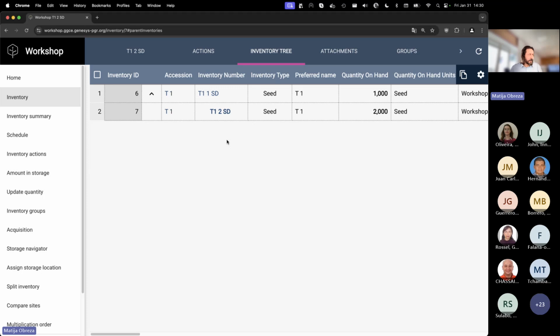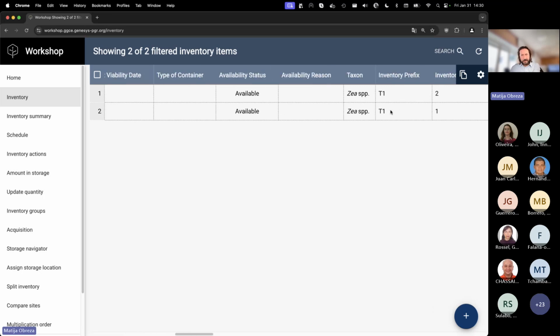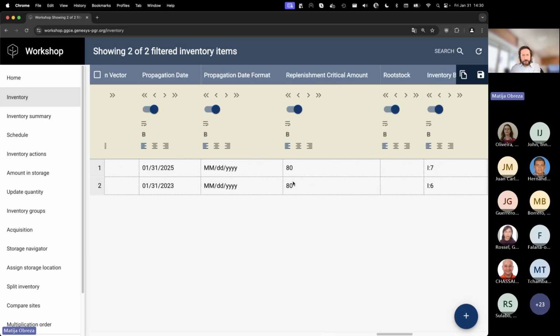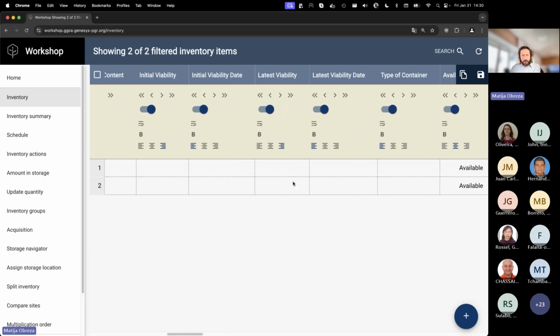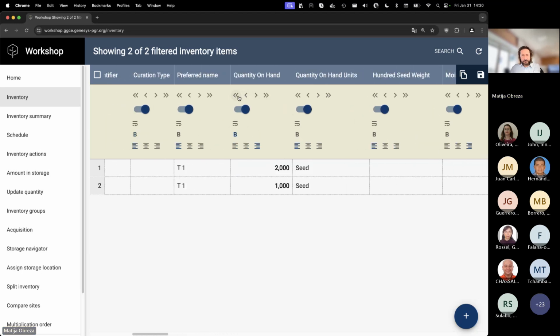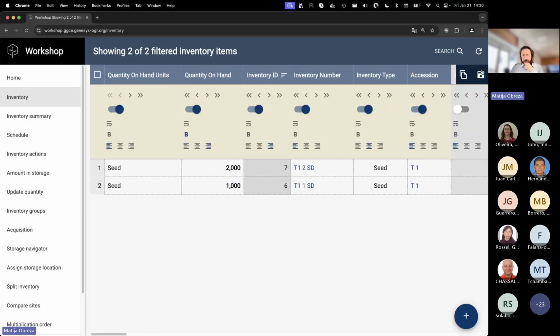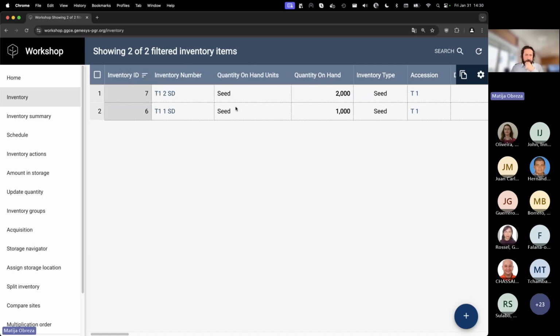With that, the important part: what is not an inventory? So I want to move some stuff around here. Let me just do that quickly. I want to move quantity somewhere where I can see it more easily, but I forgot where it is. If I take a sample of the material, right? So if I take 50 seed from this, call it packet, yeah?